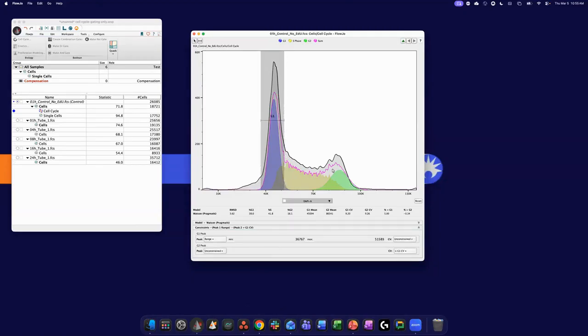I could do the same thing for the G2 if I'd like. Okay, this is what I think to be the G2, and I'm going to constrain that. Again, my model's RMSD is kind of flirting around 3.5. It hasn't changed a whole lot. But these are just things I'm trying to see if I can get that RMSD to come down.